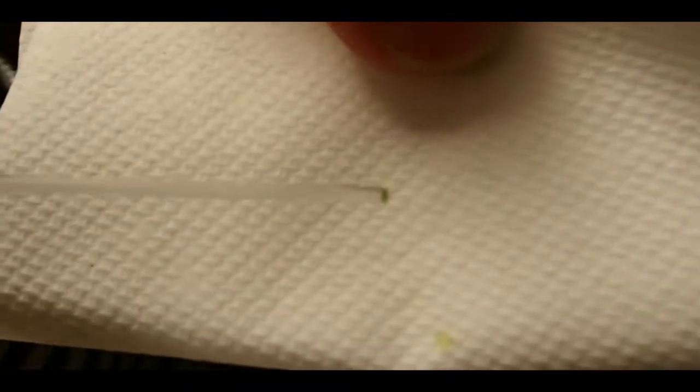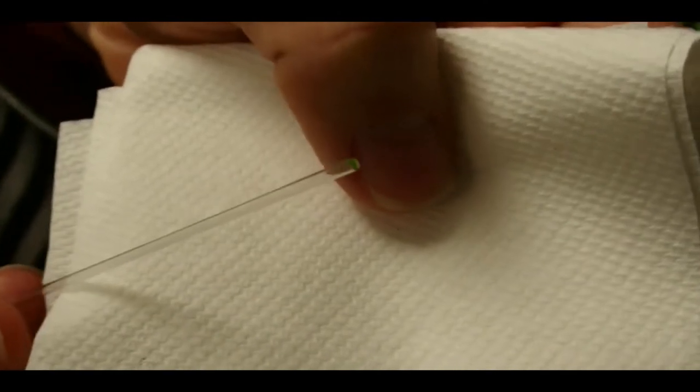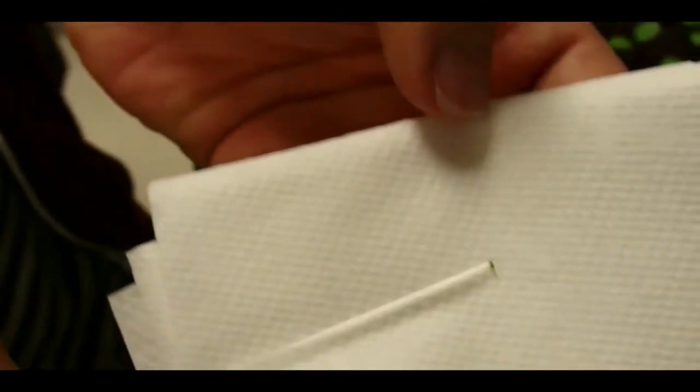And then if you look at this, we'll put it against the white, put it horizontal, you'll see there's a little bit of green stuck in there. That's a little leaf disc, and that's going to get dropped into the appropriate well and just sit there like that. Against a white background, it's easy to see that you have a green disc in there.